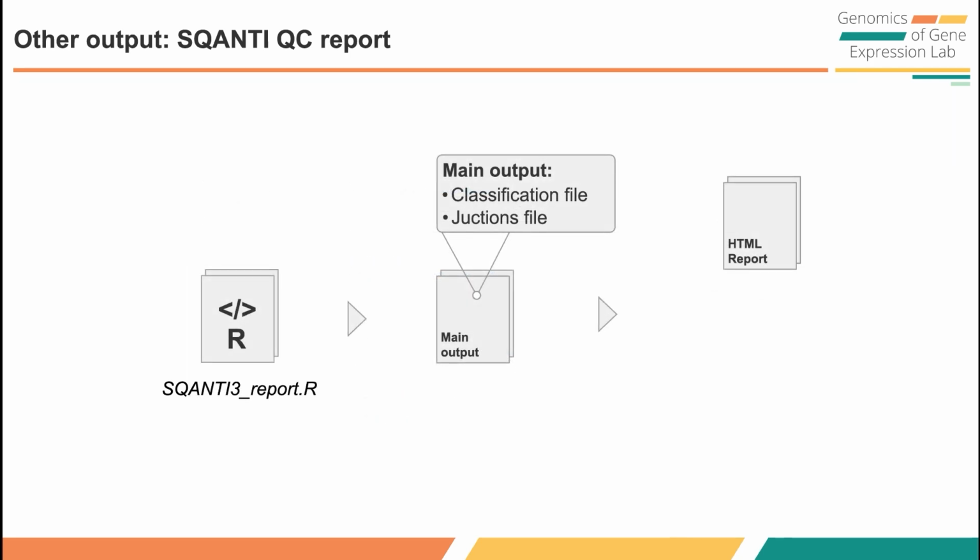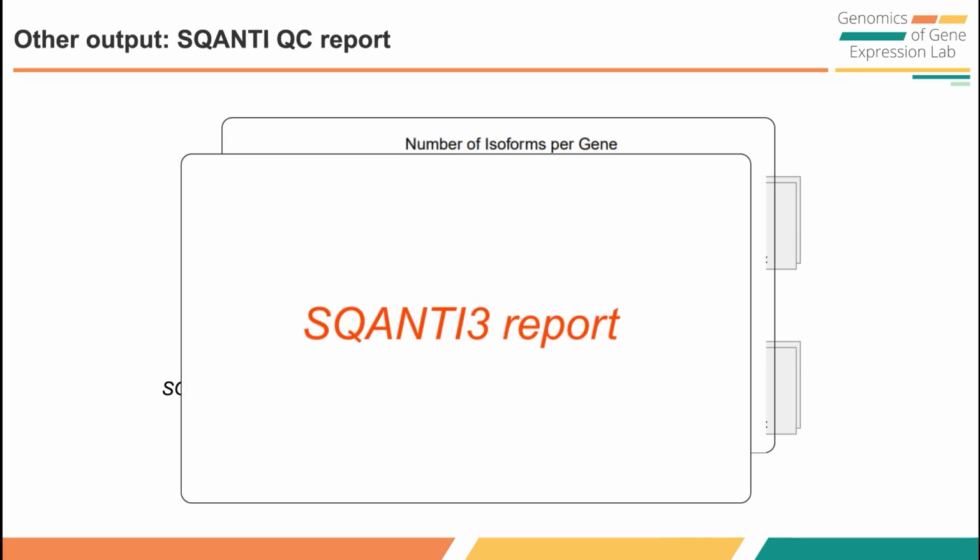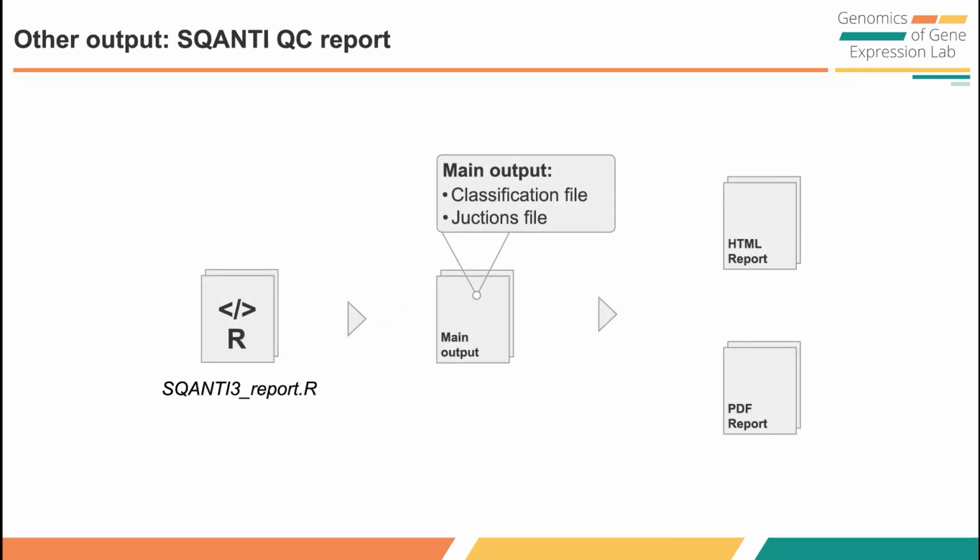Or a PDF report. Or missed entirely if the user does not wish to see a report for the quality control run. Users proficient in R are welcome to modify the R script to add new figures, and we will constantly be adding new figures.